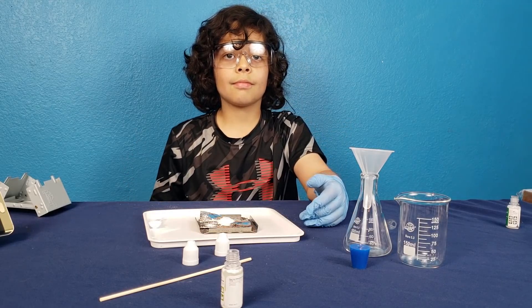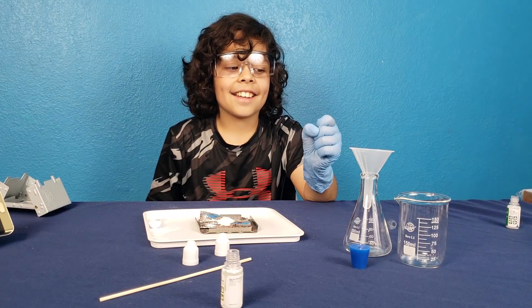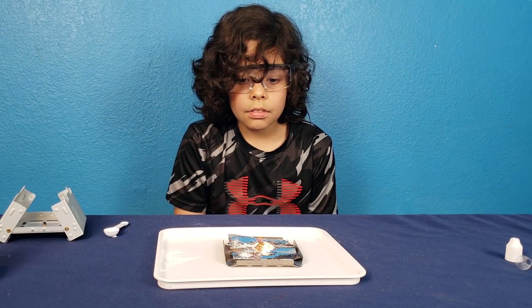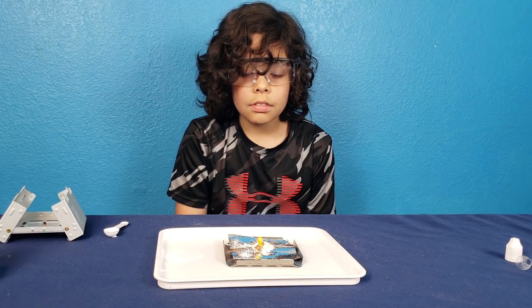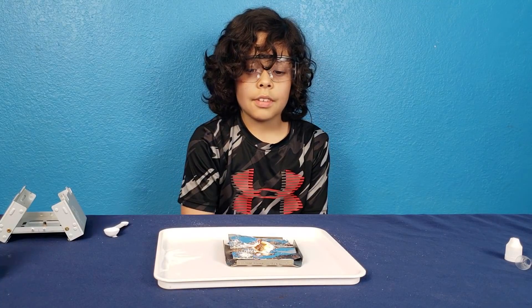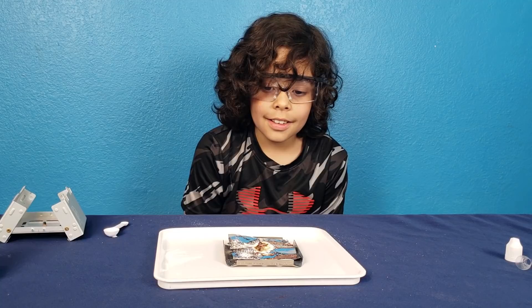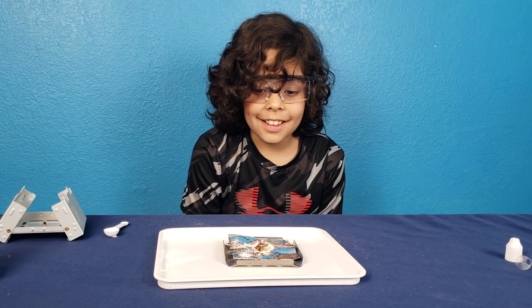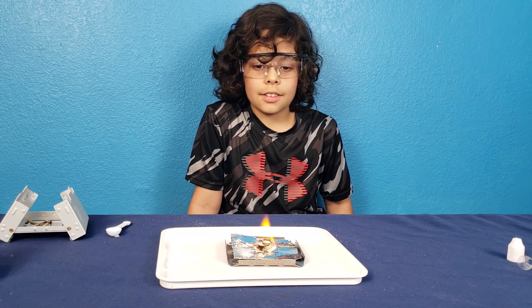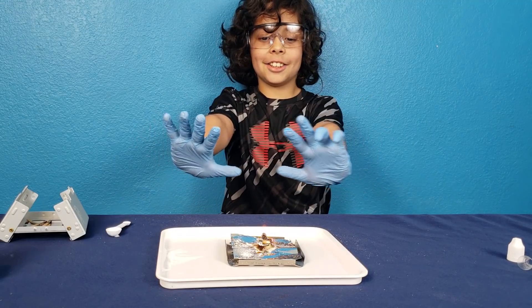Are you ready, Xavier? Yes! It's time! So kids at home, don't play with fire — let your parents handle this. It's slowly starting to grow up, like a snake. Like a little campfire. Here, warm your hands — nice and toasty.